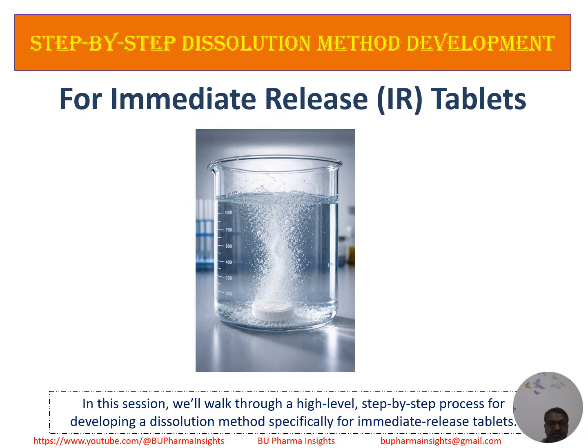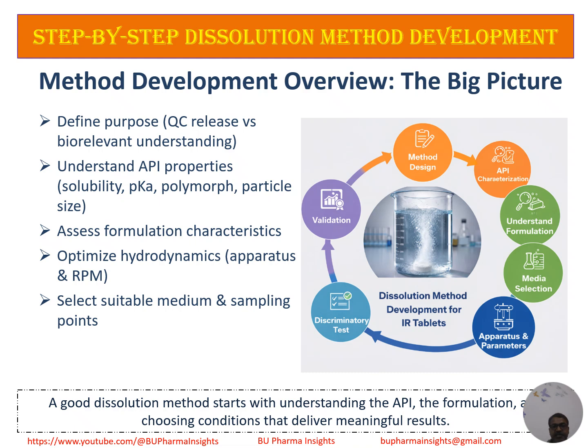Let's get started. Dissolution testing is multifunctional. It is used for exploration, confirmation, and routine monitoring. Because these goals are different, the acceptability, variability, method flexibility, and sensitivity also differ from stage to stage. So even though the test looks the same, the purpose changes, and that drives different expectations.